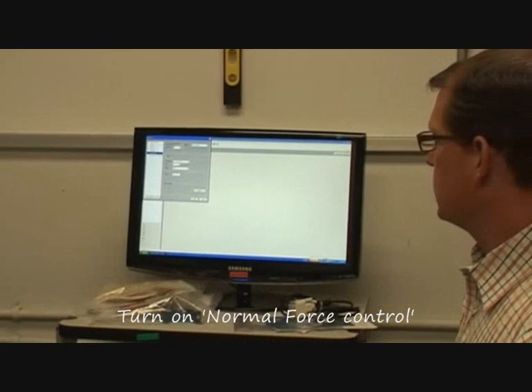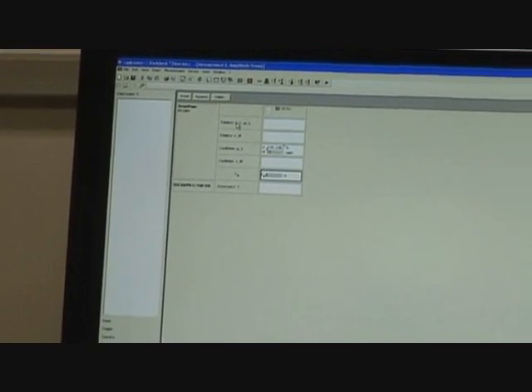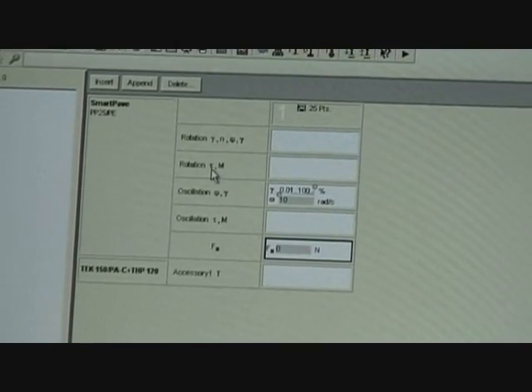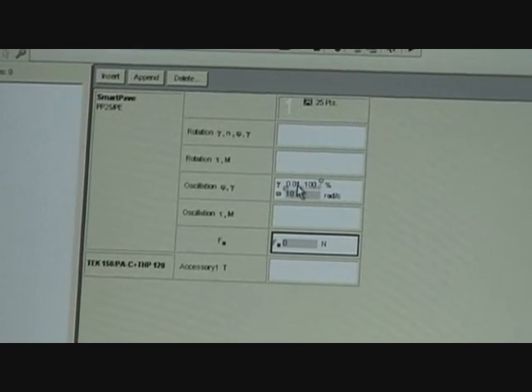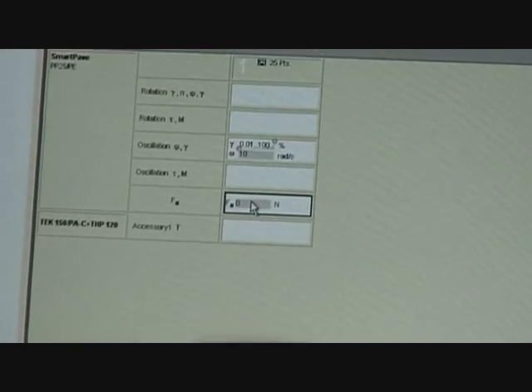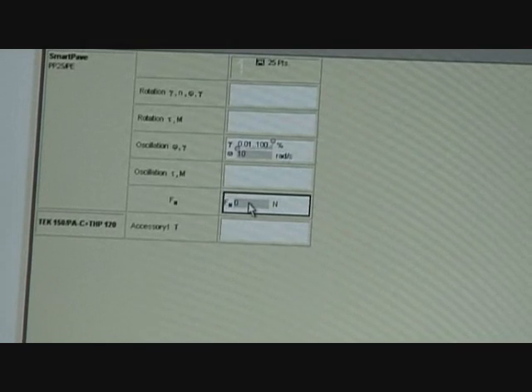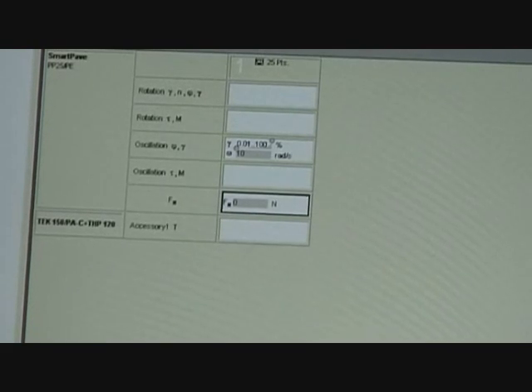I turned on normal force control, which basically meant I clicked this box over here. If you look on the side there are a few different boxes — these are saying, hey, if you're running a rotational test, you set it up here by shear rate control or rotational stress control. We're doing an oscillatory test and we're doing it strain control. The other thing we can do is say, okay, for running that test, do you want normal force control, do you want it to track normal force? And I'm going to say yes — so I turned that on and said make it zero.